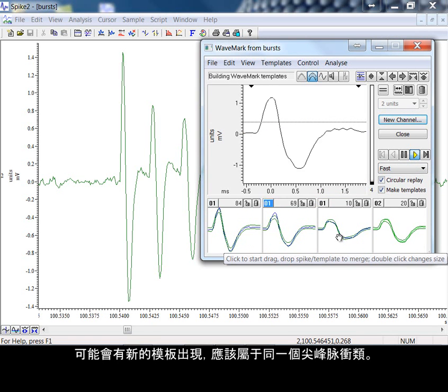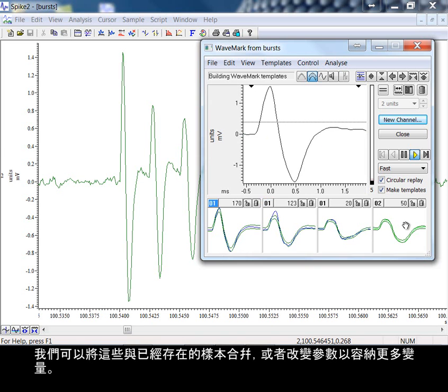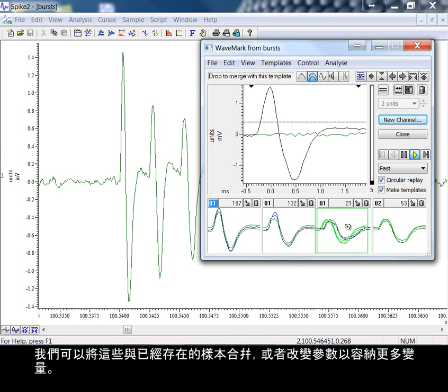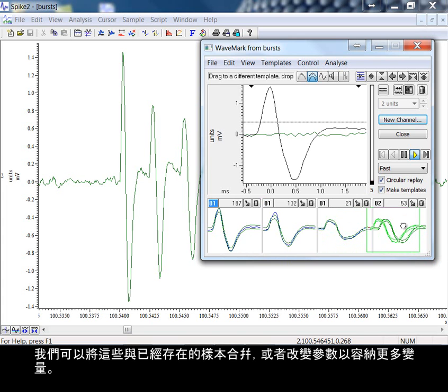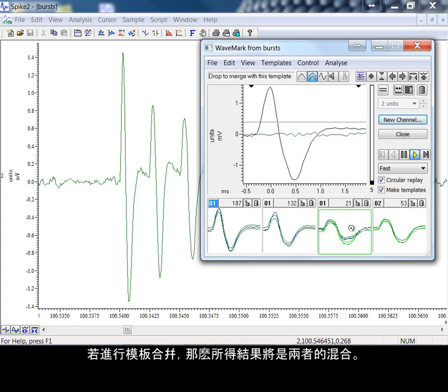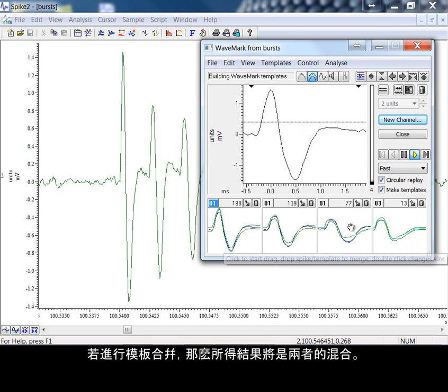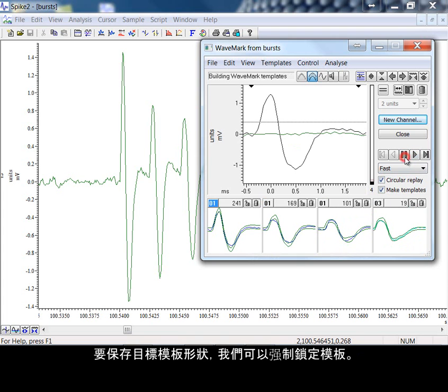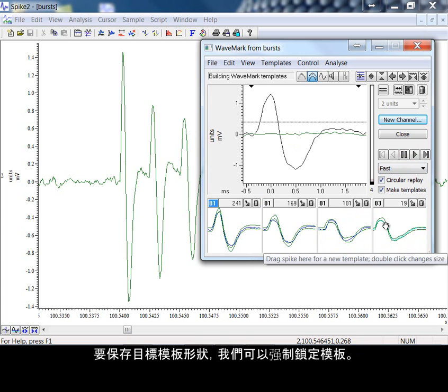New templates may appear that we consider to be part of the same spike class. We can merge these with our pre-existing examples or we could change the parameters to accommodate more variation. If we merge templates, then the result is an amalgam of the pair. To preserve the destination template shape, we can force the template to be locked.